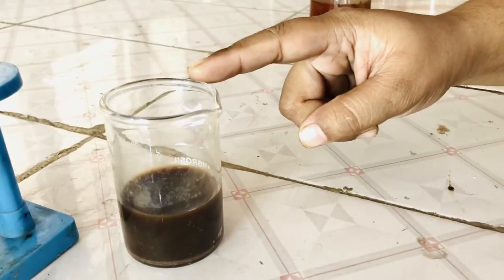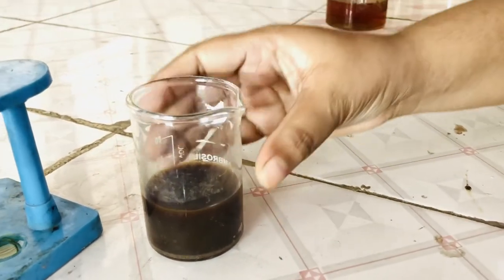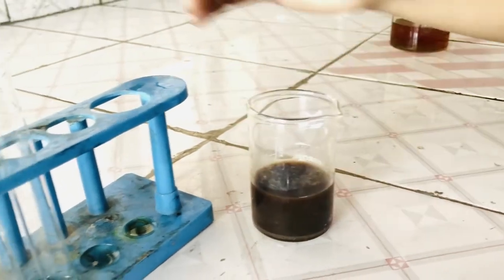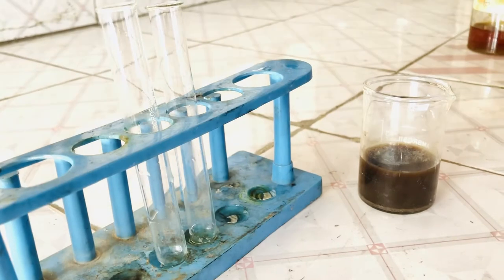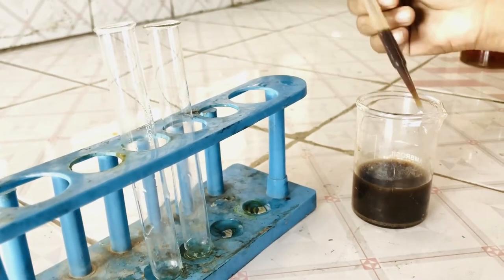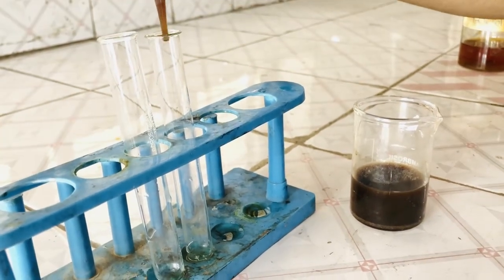Now see the extract has been prepared. So now we will add the aqueous extract of amla in both test tubes in order to prepare the test and standard solutions. We will add in equal amounts.